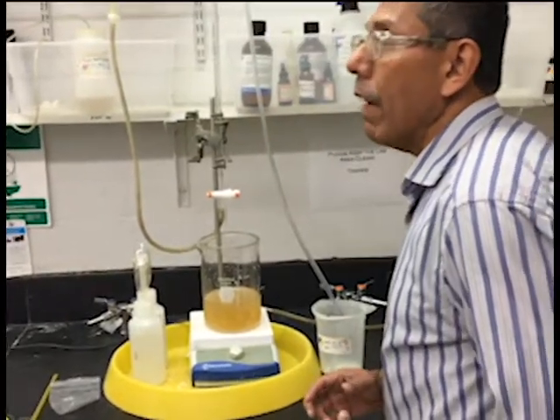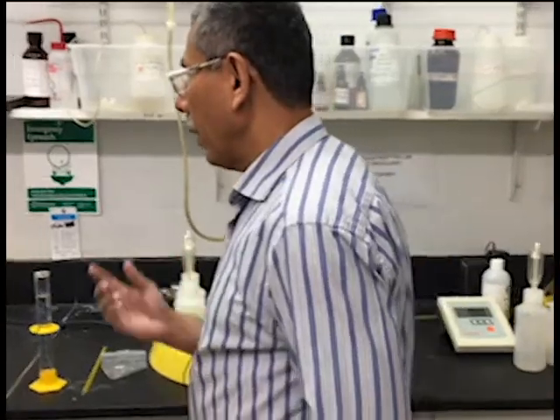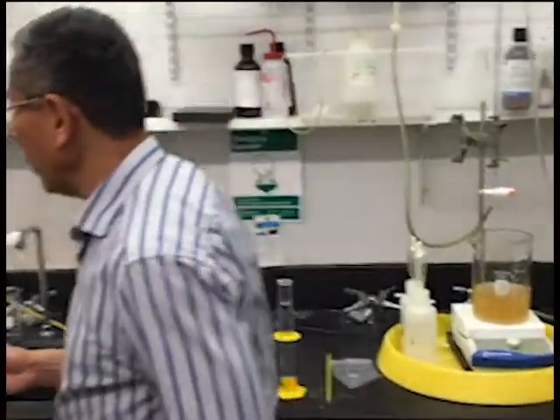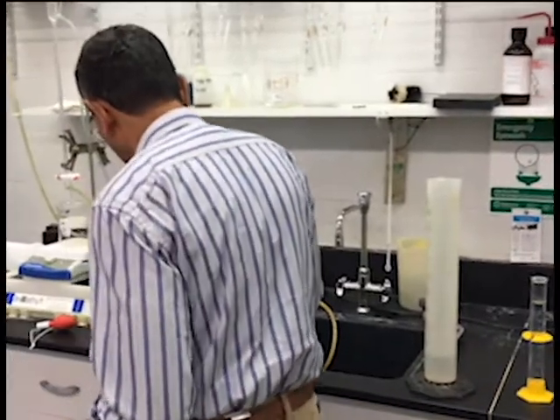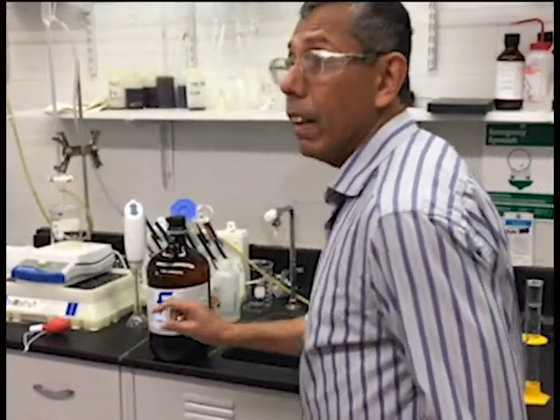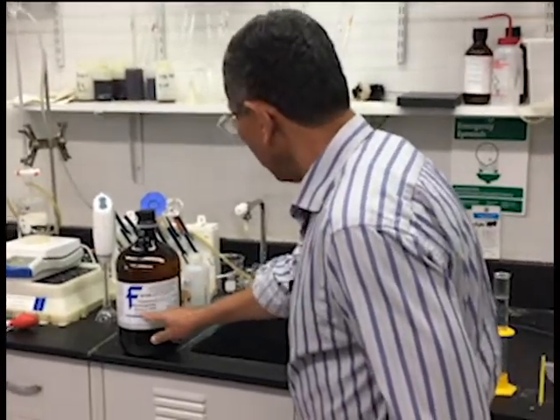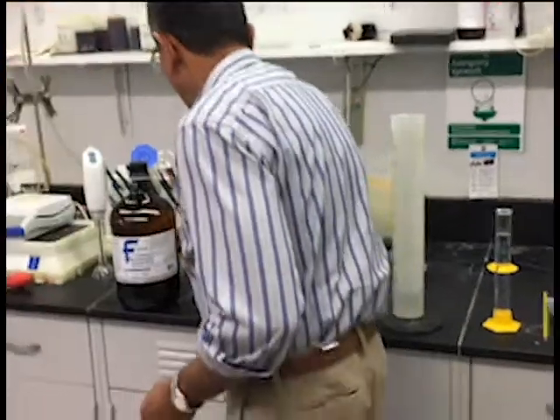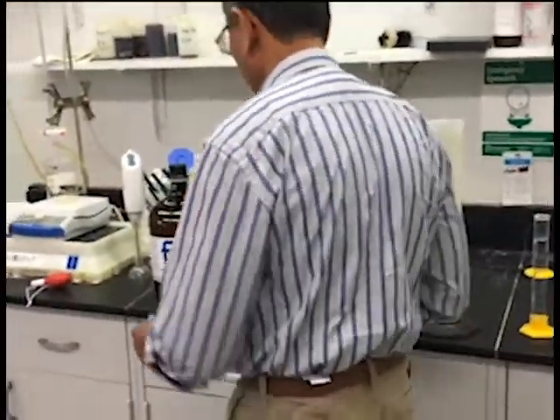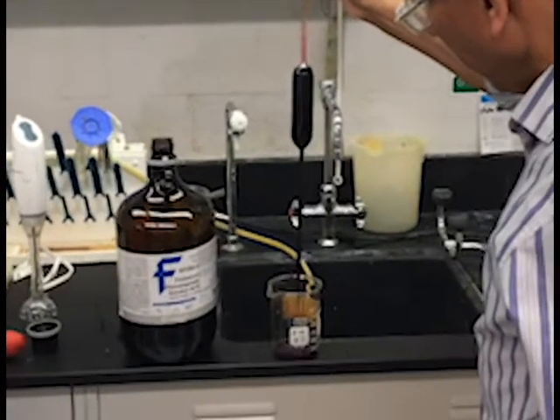Now what we have to do is add the chemicals. The main chemical we're going to add is potassium permanganate. This is the chemical that will react with the lignin. The strength of this chemical is 0.1 normal, and we need 100 milliliters of this chemical added to the beaker.